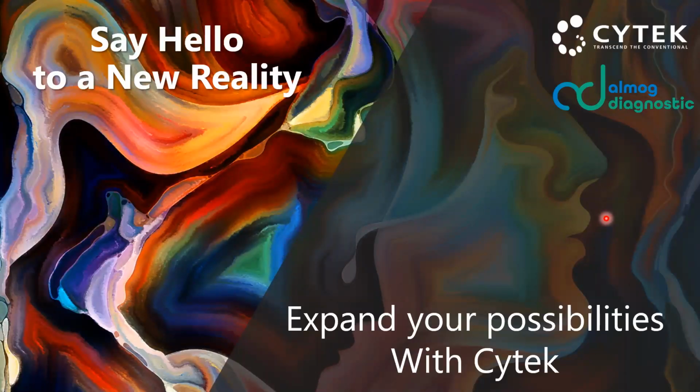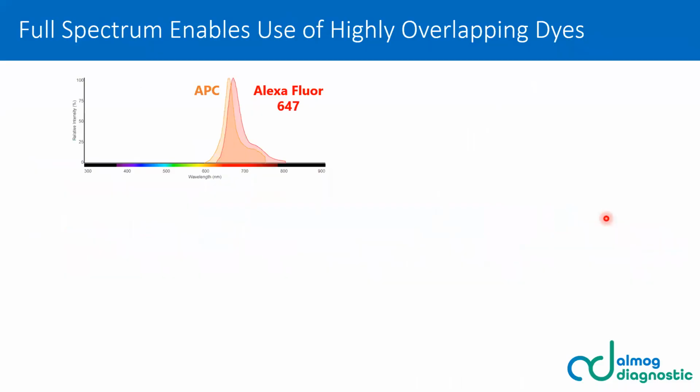So now that we have talked about fluorochromes, their unique signatures and unmixing, let's talk about the wide range of possibilities using Cytek instruments. Full spectrum analysis enables us to use highly overlapping dyes. This is something that Nitzan has already mentioned in her session, but now I would like to walk you through the superpower of spectral flow cytometry.